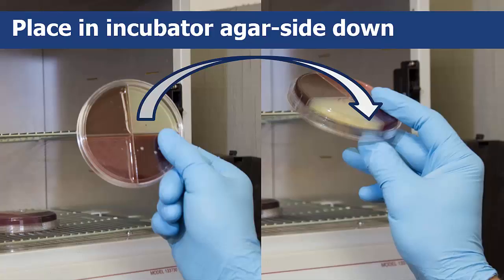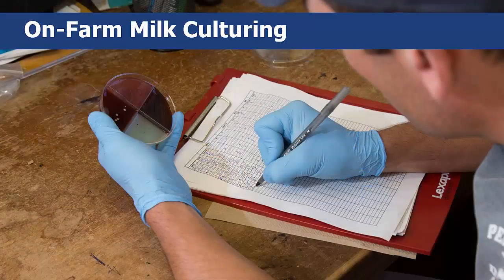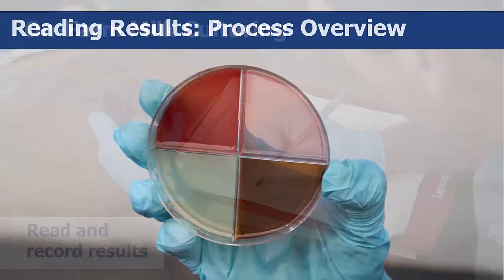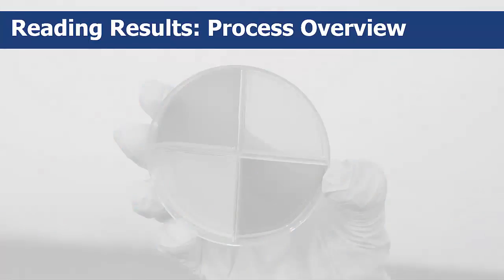After 24 hours, you can read the results. Once your plates and samples have been incubated, the next step will be to read and record your results. You'll read the plates and record the bacterial growth results on the provided forms.